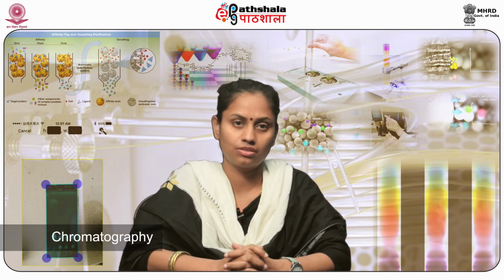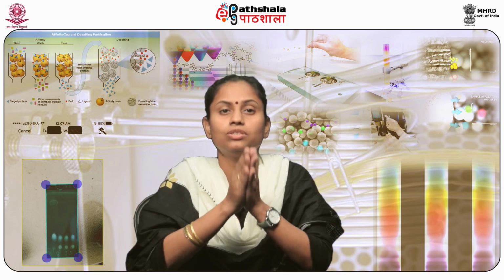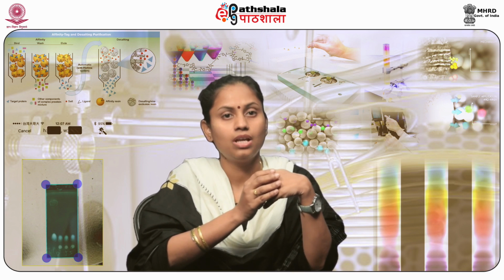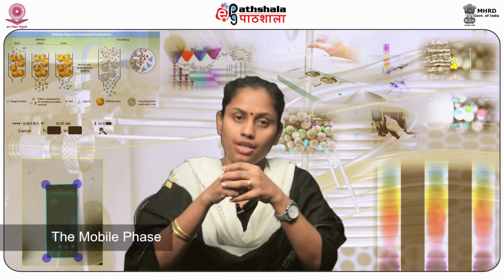So first, let me start by telling you what chromatography is. Chromatography is a technique for carrying out separation of a mixture of compounds into its individual components. Now, there are basically two phases involved in chromatography. First, a stationary phase, and second, a mobile phase. The mixture of compounds that are to be separated are introduced into a chromatograph via the mobile phase.